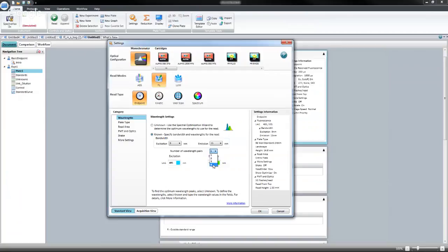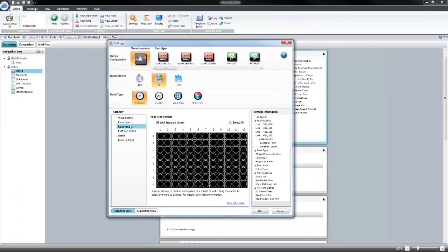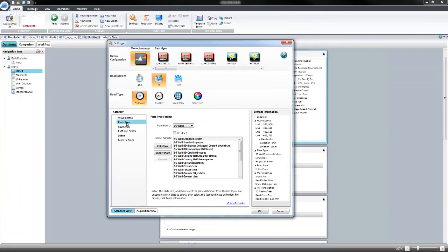So you can go to the wavelength you're looking for, and it's kind of cool here. You put in whatever wavelength, and the color populates to that as well. Just another little interesting feature that's fun to use. So, kind of walking down the side here.